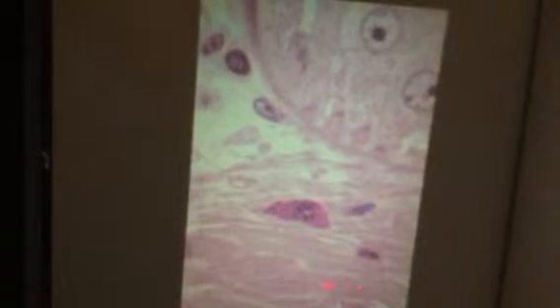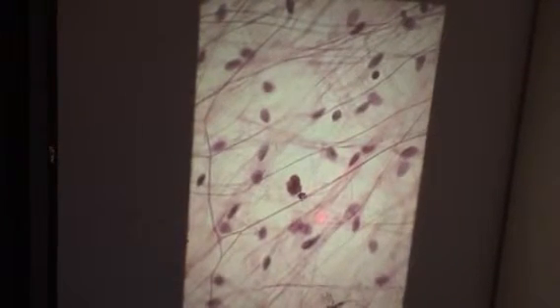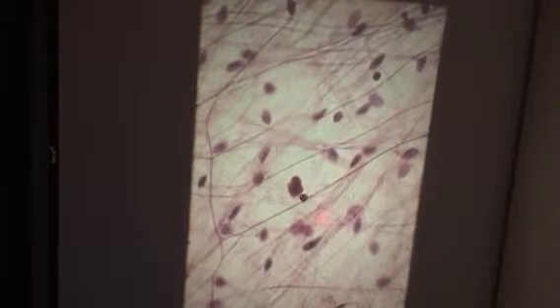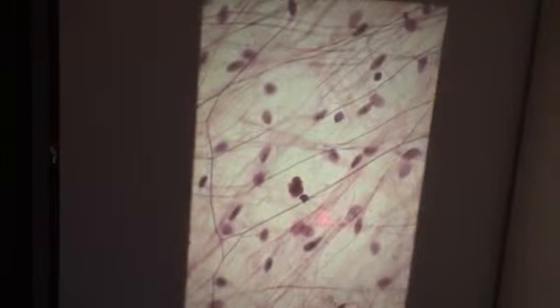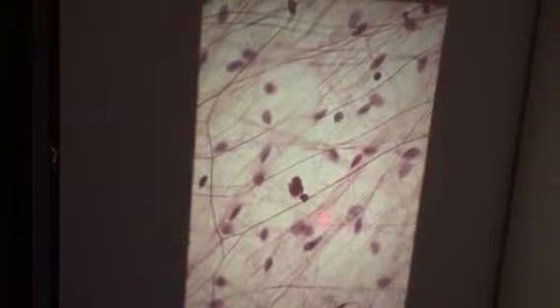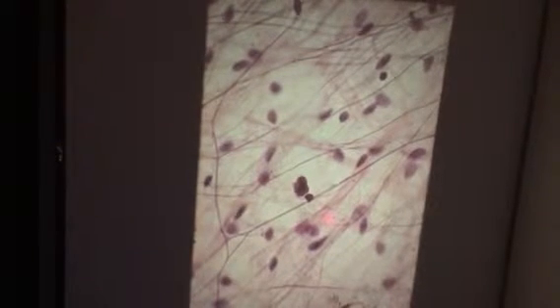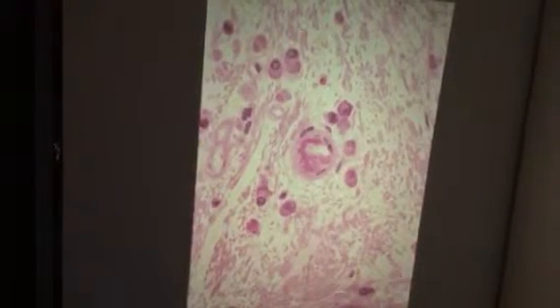And these fibers would be collagen fibers. How about these fibers? Elastic fibers. And that cell right there is another mast cell. And these fibers in the background here, those are collagenous fibers. How about all this other stuff in between? Yeah, ground substance. Can you see ground substance? Not really. So I could put a blank slide on the stage.